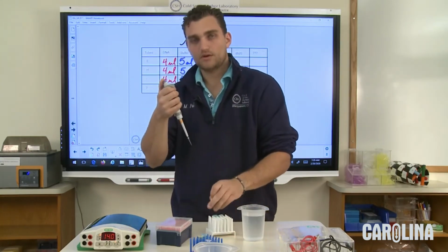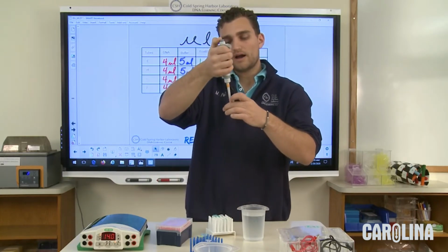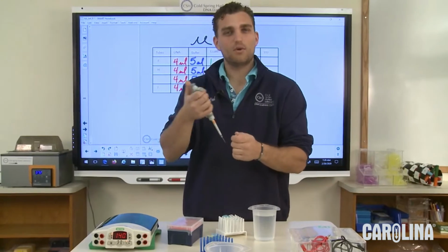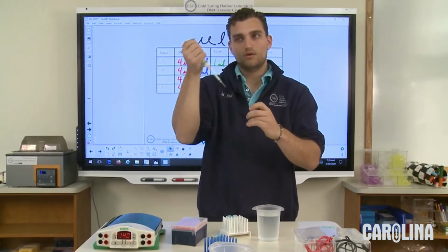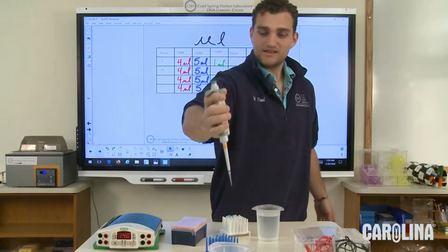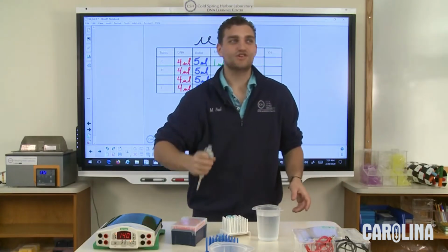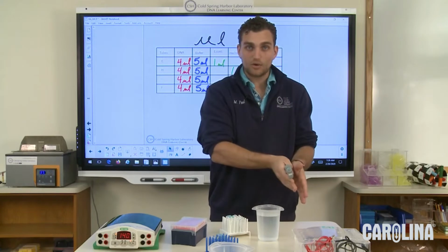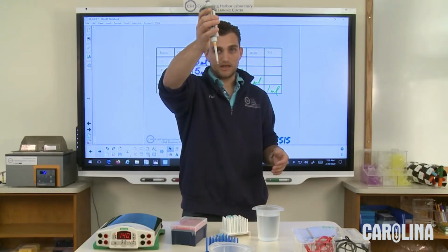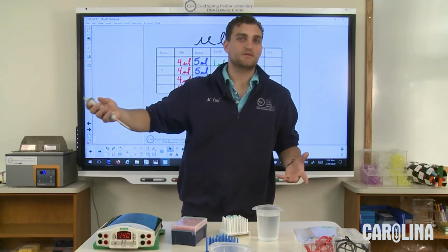I have a question for you. Why do I need to change my tip ever? Why is that an important thing? What will happen? Well, yes, exactly. Contamination, awesome job. So if I'm working with EcoR1 and I don't want to work with HindIII, I can have an EcoR1 tip right here, and then I'll have a HindIII tip at a different point in time.